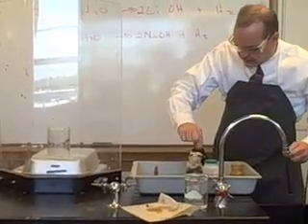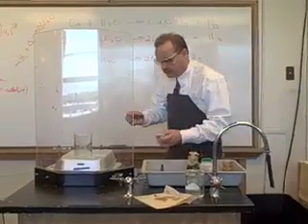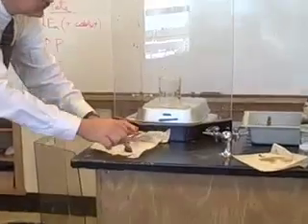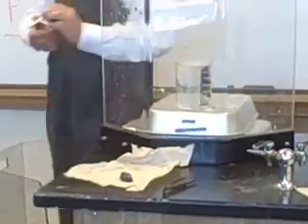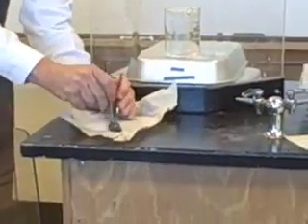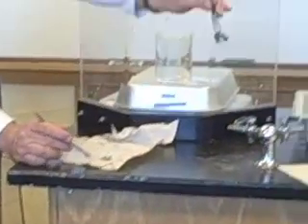What do you think potassium is going to do? More or less active? Potassium also is a soft metal, and it's the softest of the four that I've been working with. It doesn't take much effort, just cut it. Notice how shiny it is on the inside?